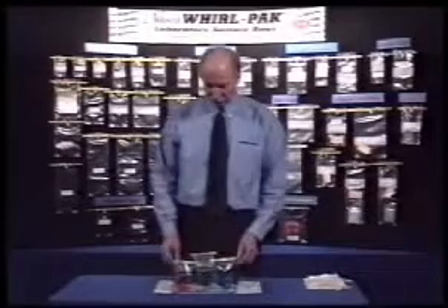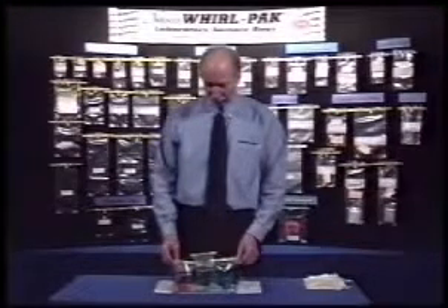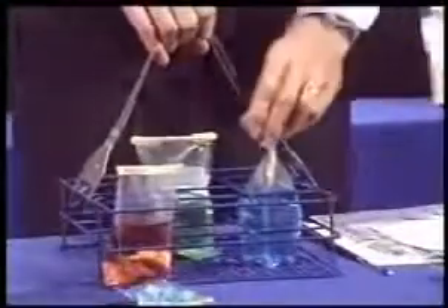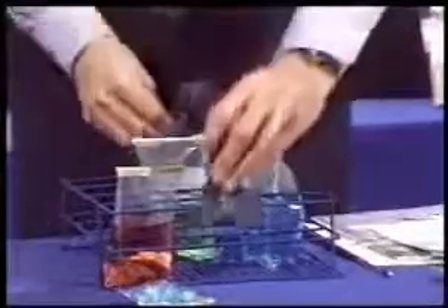Except for the Whirlpack stand-up bags, the other bags need a rack to keep them upright. A convenient carrying handle makes it easy for a person to carry a rack of bags with one hand. The handle fits all sizes and can be attached from any side of the rack.